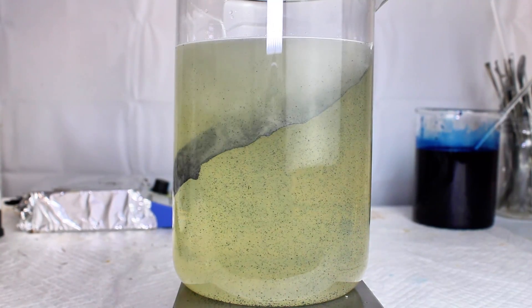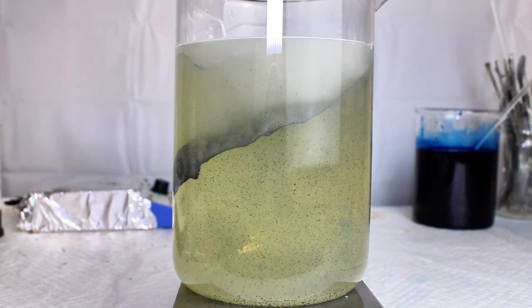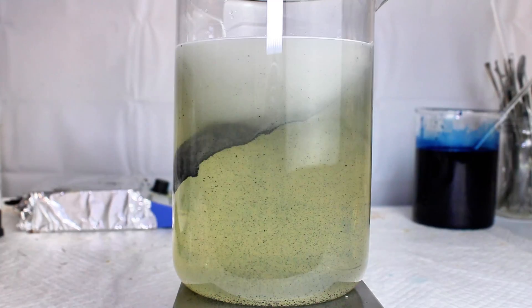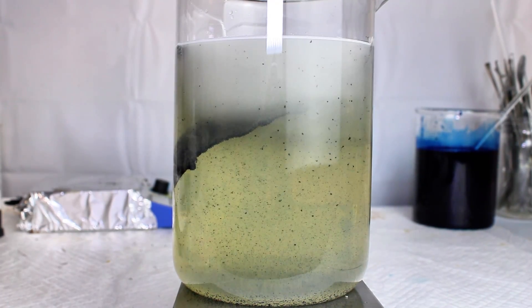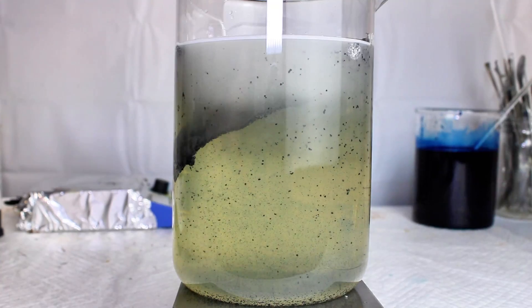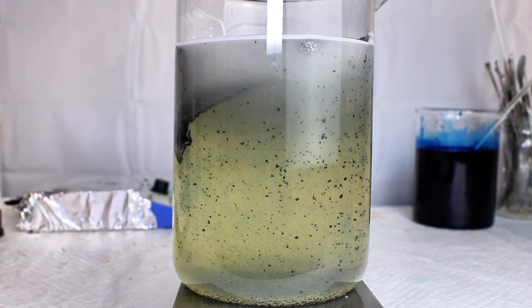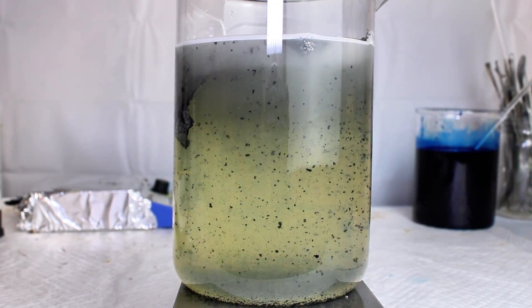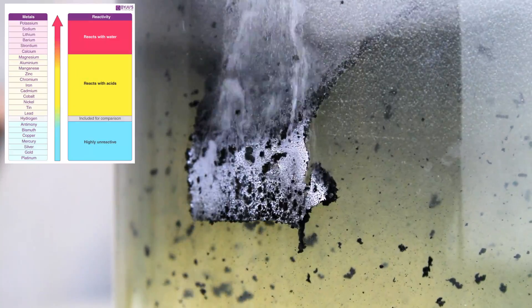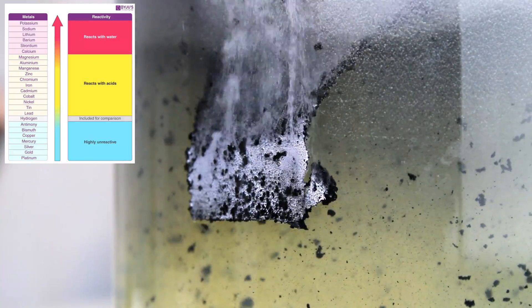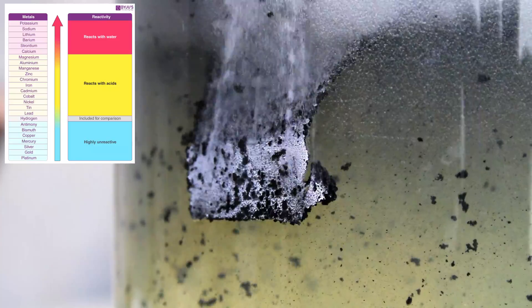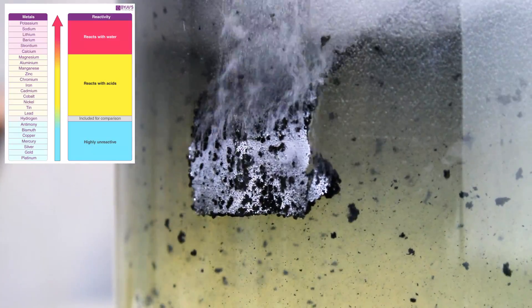This is called a single replacement or single displacement reaction, and it's a type of redox reaction where aluminum is oxidized and bismuth is reduced. I use this method fairly often to precipitate metals, and aluminum will effectively precipitate several metals, including gold, platinum, mercury, silver, copper, lead, tin, nickel, and cobalt, in that order.